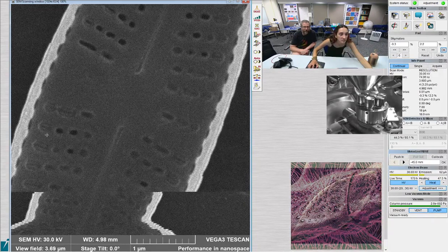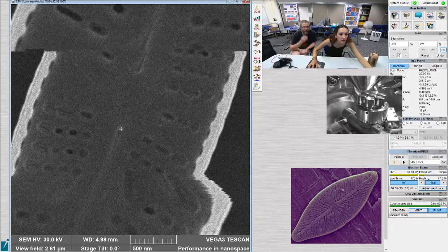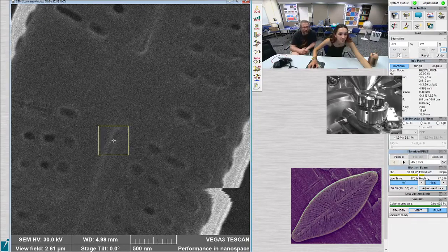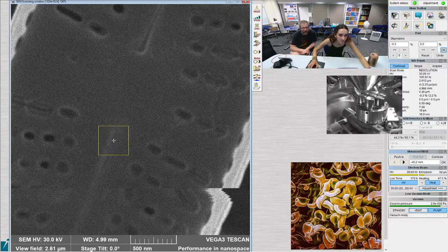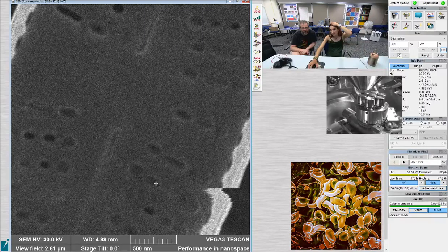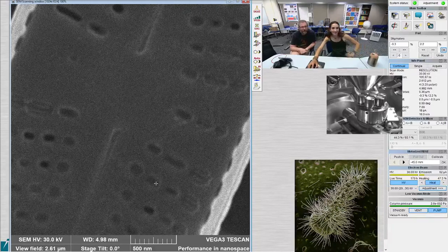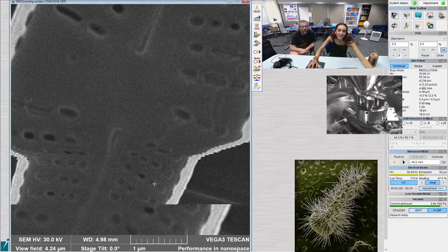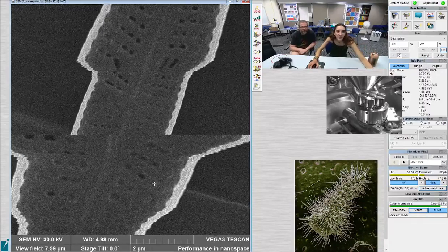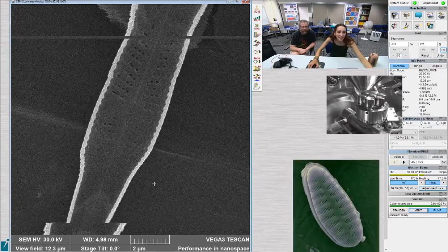I'd zoom in on the raphe, or one of those things. One of these ones? Yeah. Those are weird. The raphe. Like the side areolae have little partial coverings on them. I think I made it worse. Do you? I don't know, but we'll see. The raphe looks clear.